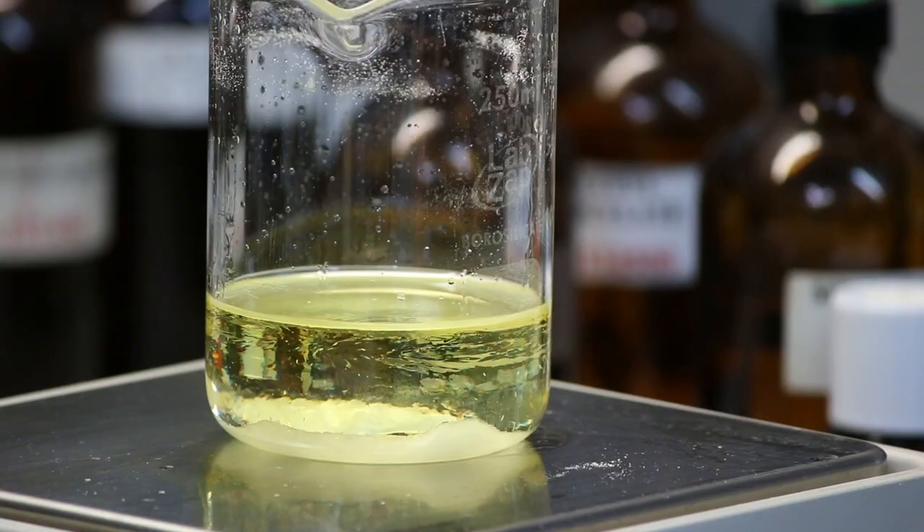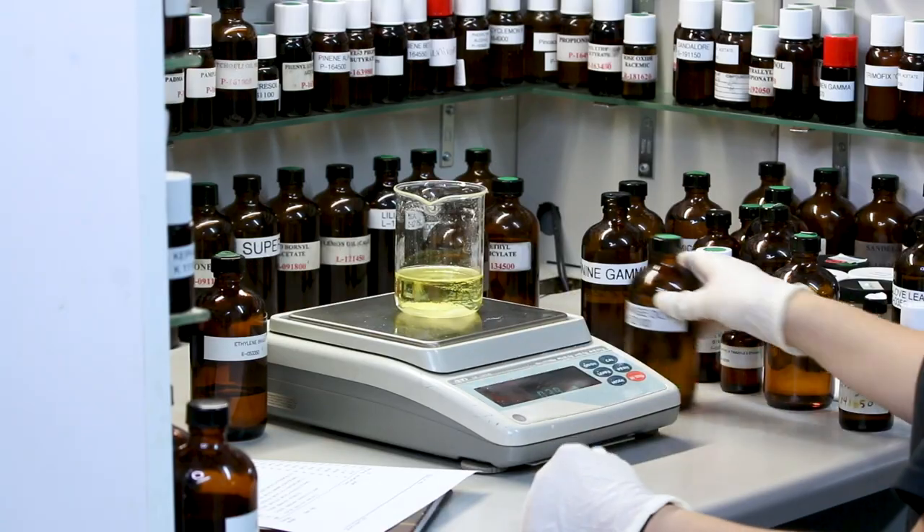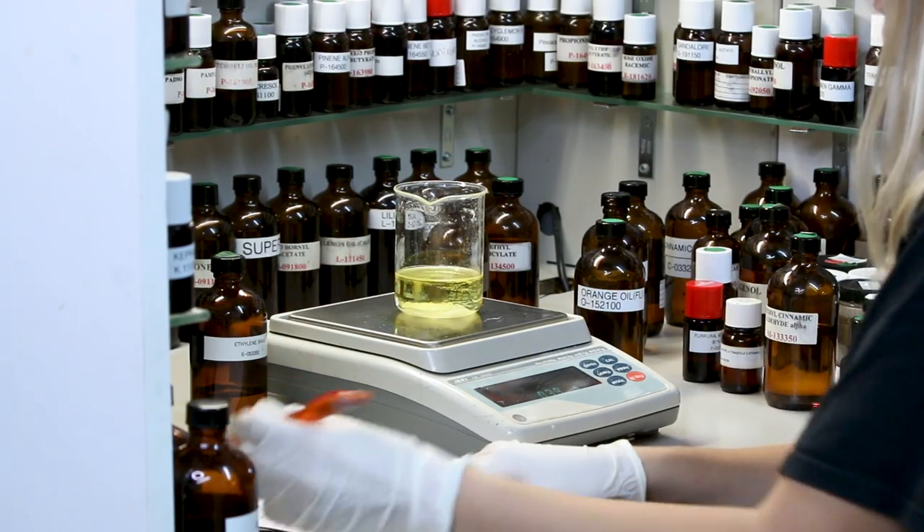After we're done, you weigh the beaker with all its components. You check the formula by subtracting the original weight of the beaker to make sure you're at 100 grams. We're at 100.